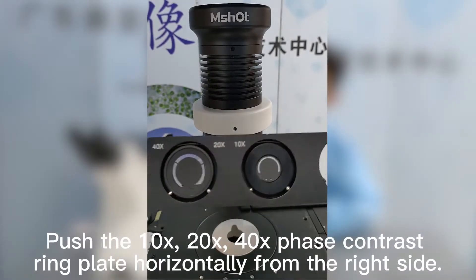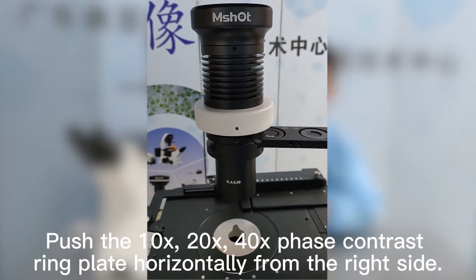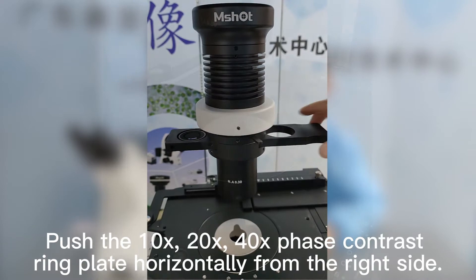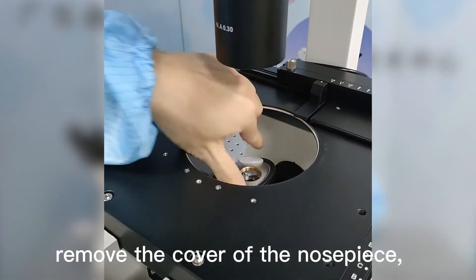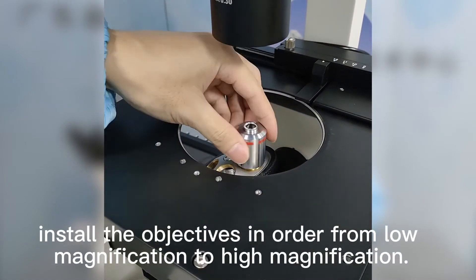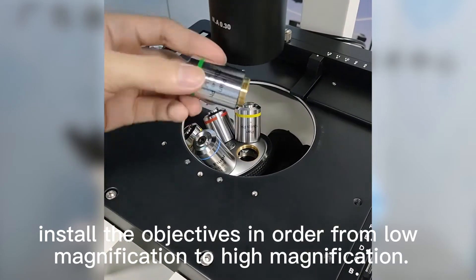Push the 10x, 20x, and 40x face contrast ring plate horizontally from the right side. First, remove the water drop plate and the cover of the nose piece. Then install the objectives in order from low magnification to high magnification.